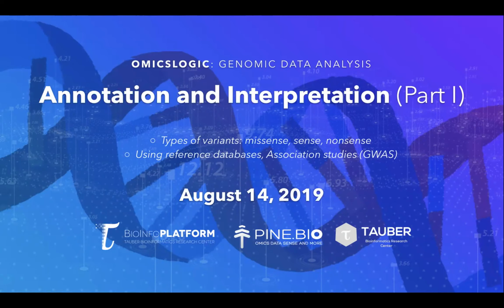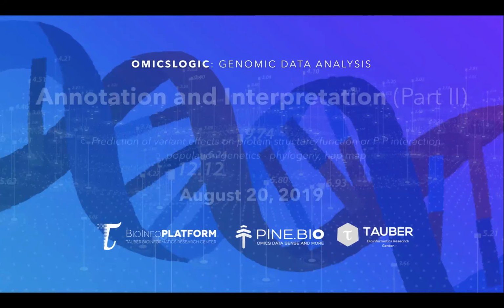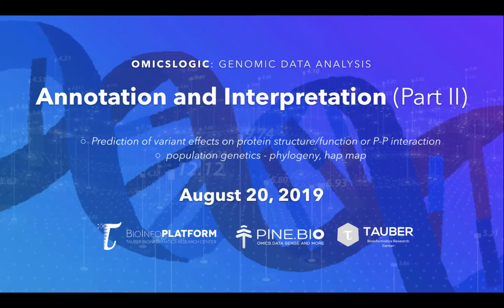So we'll take a look at several examples where we can use the information in the DNA sequence as a result of processing that data and then correlating it to a specific phenotype, like, for example, arising mutations that come as a result of treatment, or that help us find the differences between genomes of infectious agents, pathogens in different regions. We'll also look at the protein structure impact and the function, and we'll talk about what are some methods to understand population genetics. How do we look at phylogeny? How do we understand the relationships that are defined by the sequence in the DNA?